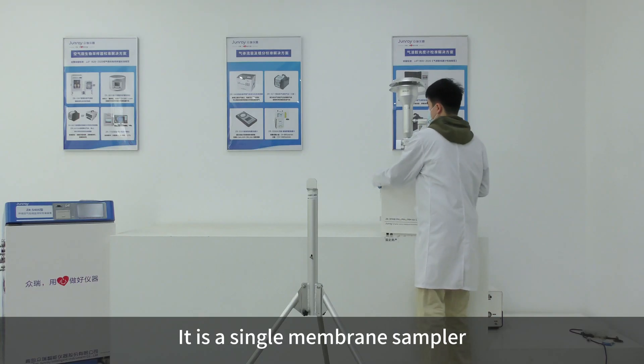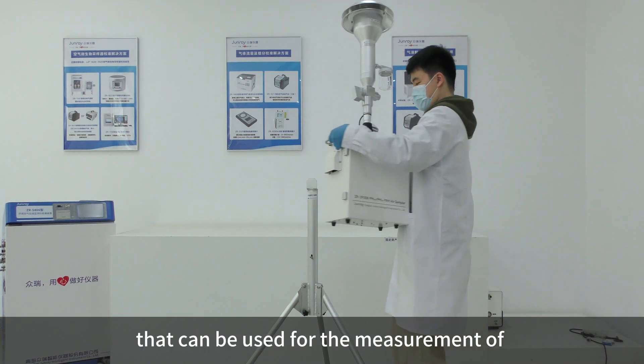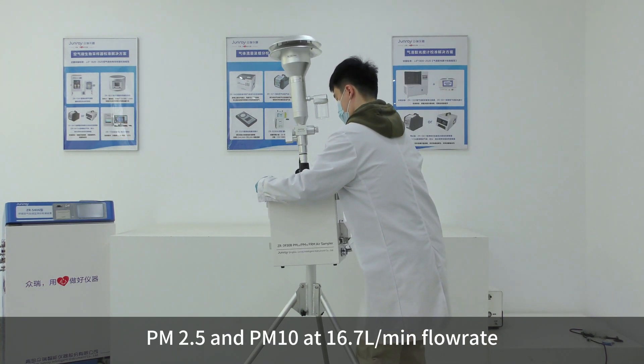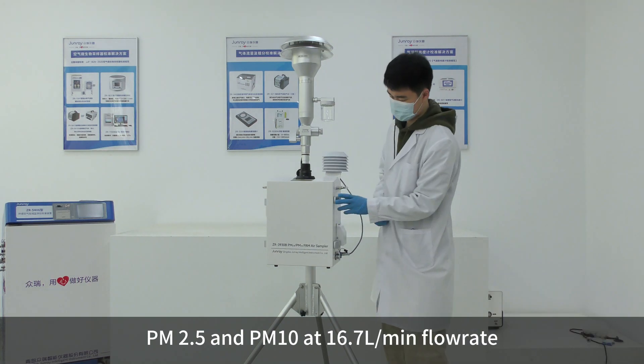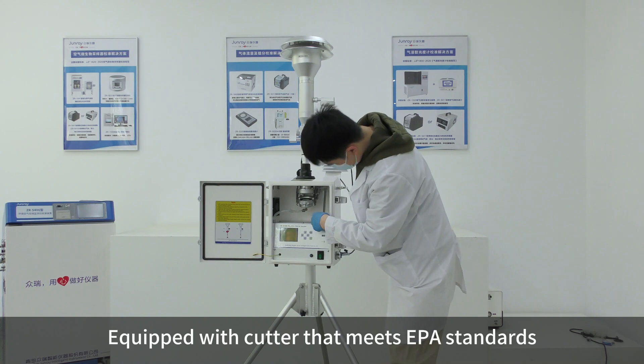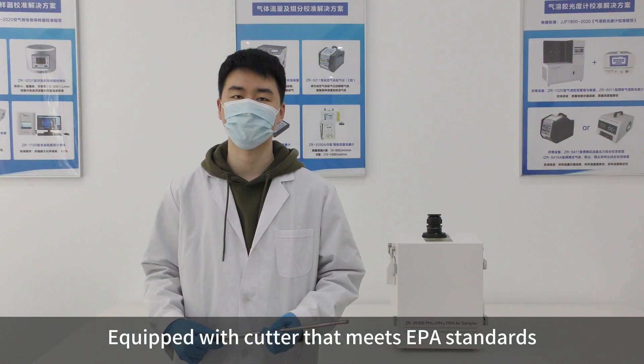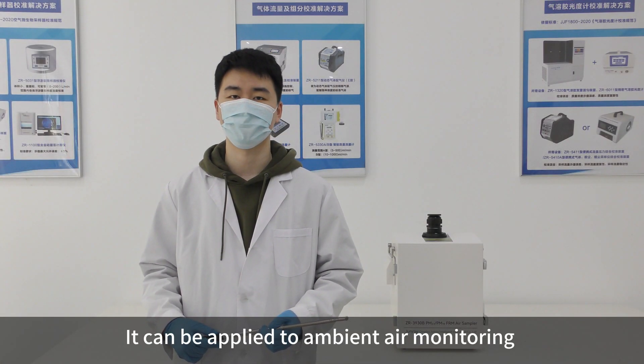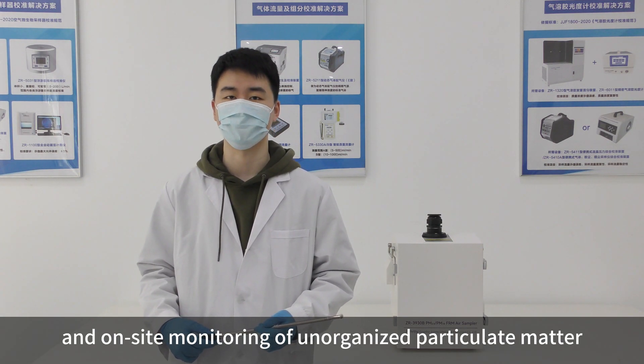It is a single membrane sampler that can be used for the measurement of PM 2.5 and PM 10 at 16.7 L per minute flow rate. Equipped with a cutter that meets EPA standards, it can be applied to ambient air monitoring and on-site monitoring of unorganized particulate matter.